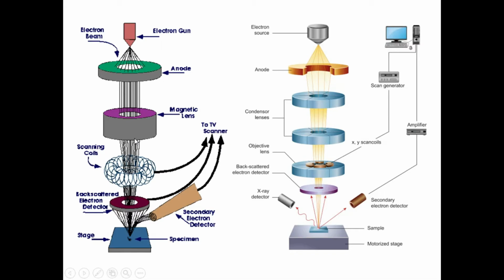After that it was reducing, and it was focused towards a single direction. You can see how the shape was different over here and here also. This is very helpful to control the electron beam and ensure the electrons end up precisely where they need to go. That's an objective lens. Sometimes you use only one magnetic lens, here they are using two condenser lenses so that the beam can pass through precisely. And one thing you should know, everything is placed inside the chamber.